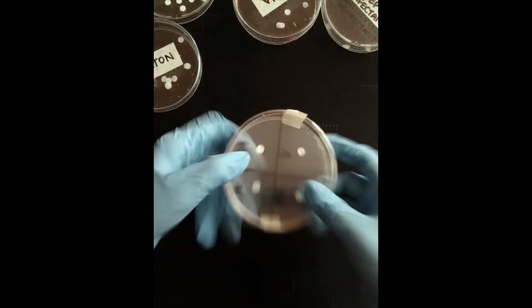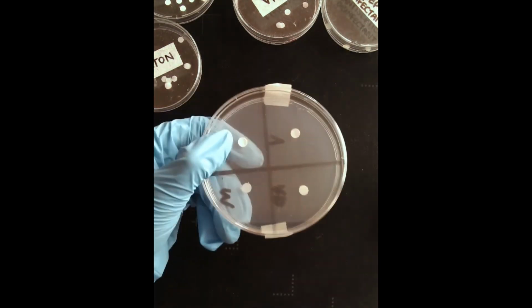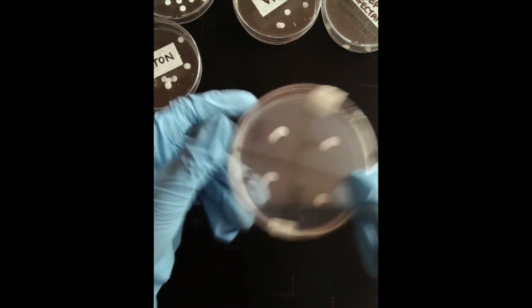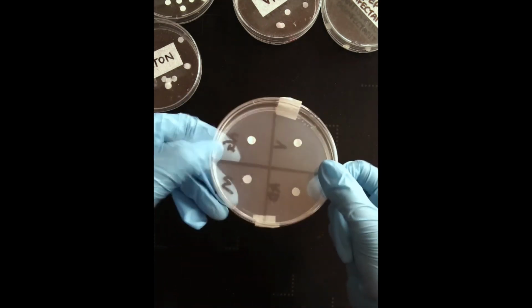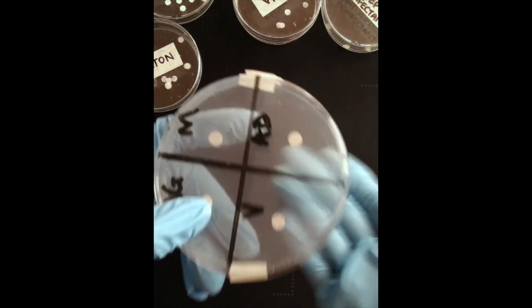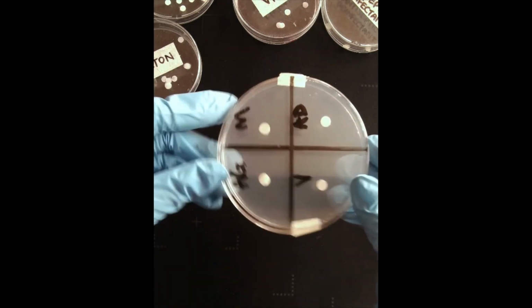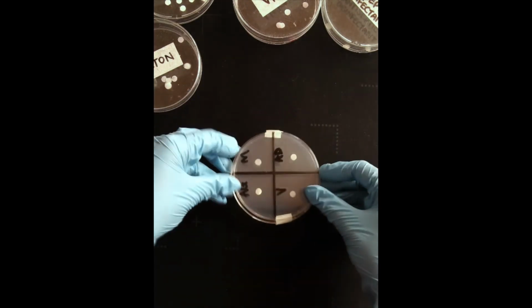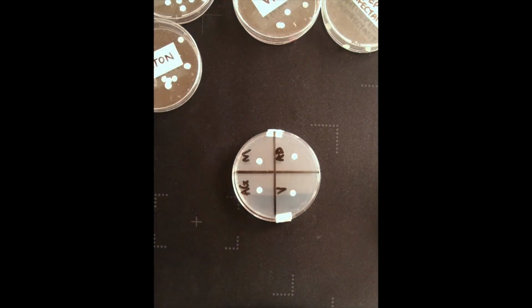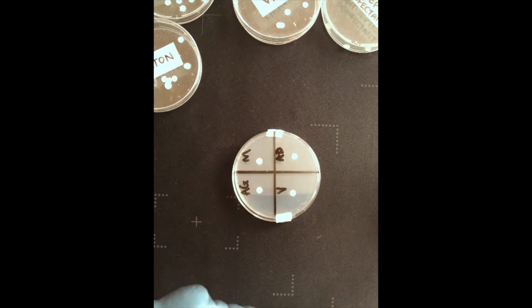As you can see, I have used tape to seal the Petri dish. This is to prevent any microorganisms from the air entering the Petri dish. Now, I'm not going to store the Petri dish this way. I need to store it upside down, so the agar jelly is at the top and the lid is at the bottom. This is to prevent any condensation from falling onto the agar. So I'm going to leave this Petri dish for about 48 hours at around 25 degrees Celsius. Remember, I don't want any harmful pathogens to grow.